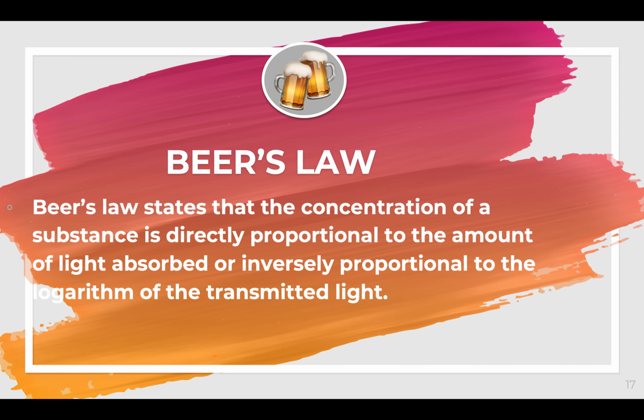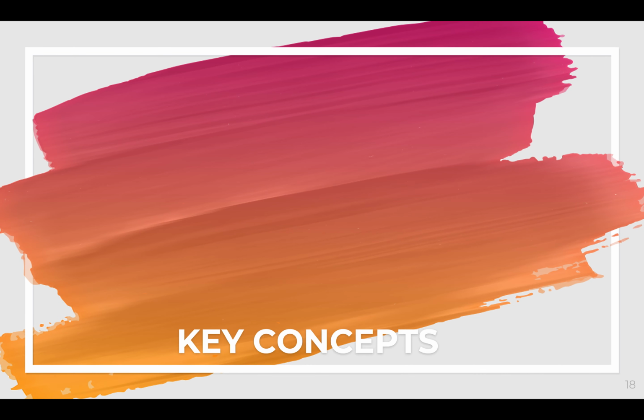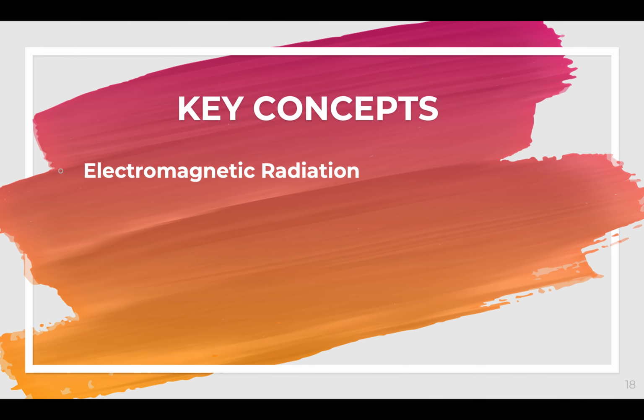Okay? So for now, let's review some key concepts. Again, electromagnetic radiation is what we are actually measuring. Technically, this is your light, the light that we are measuring. According to Planck's law, your energy is inversely proportional to your wavelength.